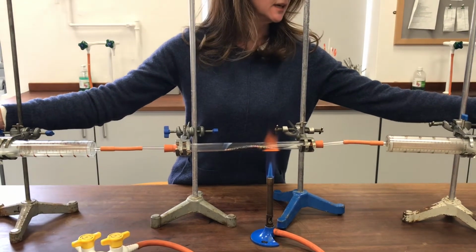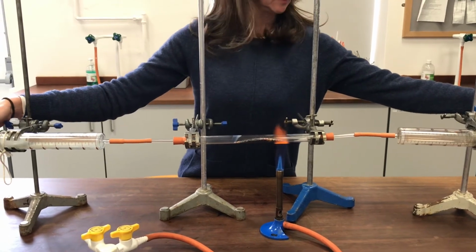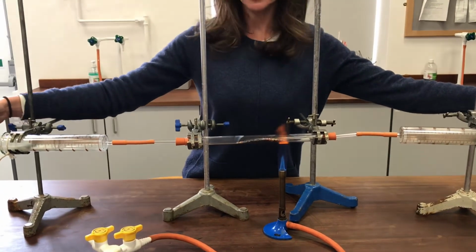Keep doing this, and I'll join you later when the experiment's finished and we can look at the volumes in the gas syringes when everything's cooled down.